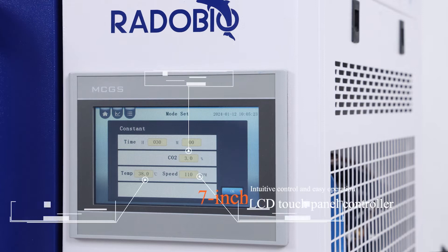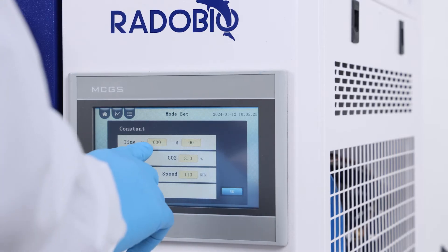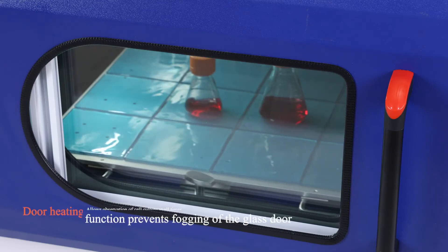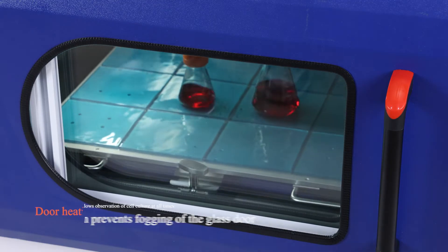7-inch LCD touch panel controller with intuitive control and easy operation. Door heating function prevents fogging of the glass door, allowing observation of cell culture at all times.